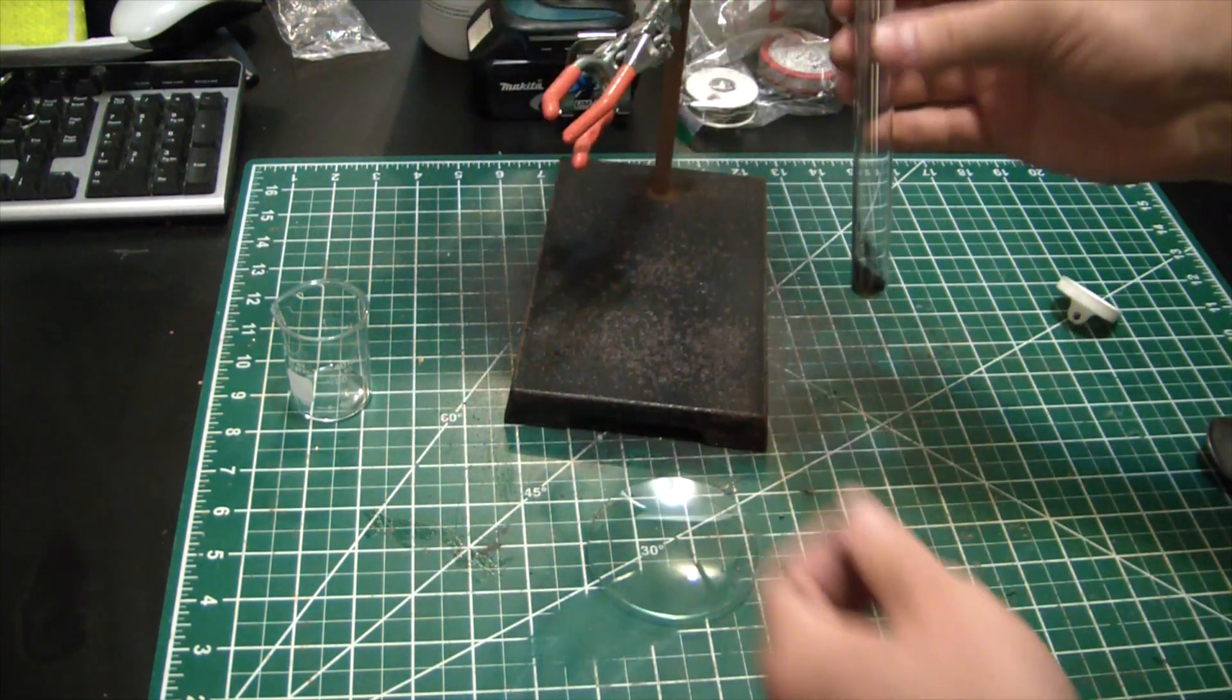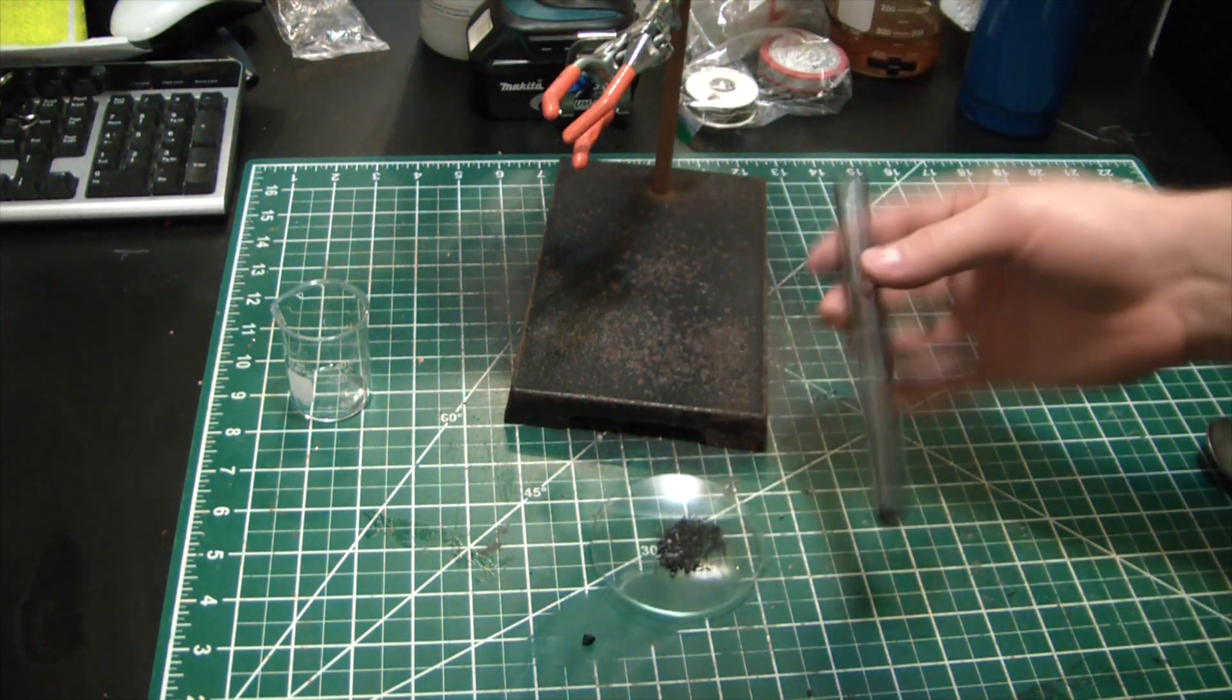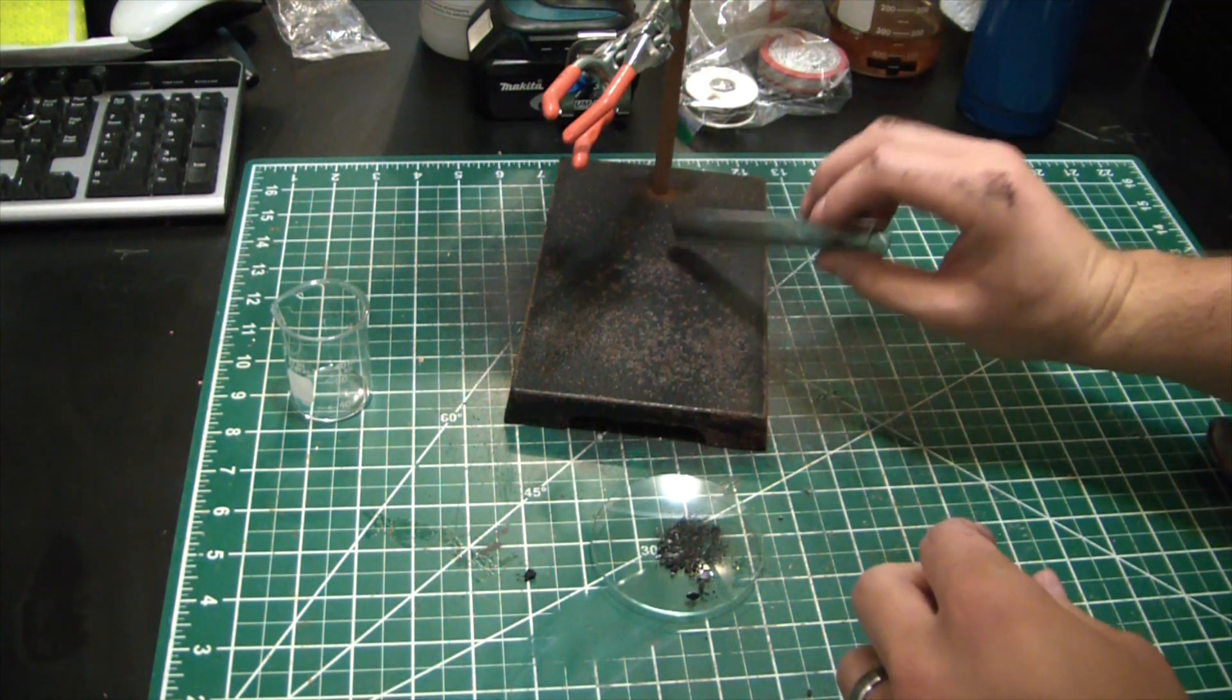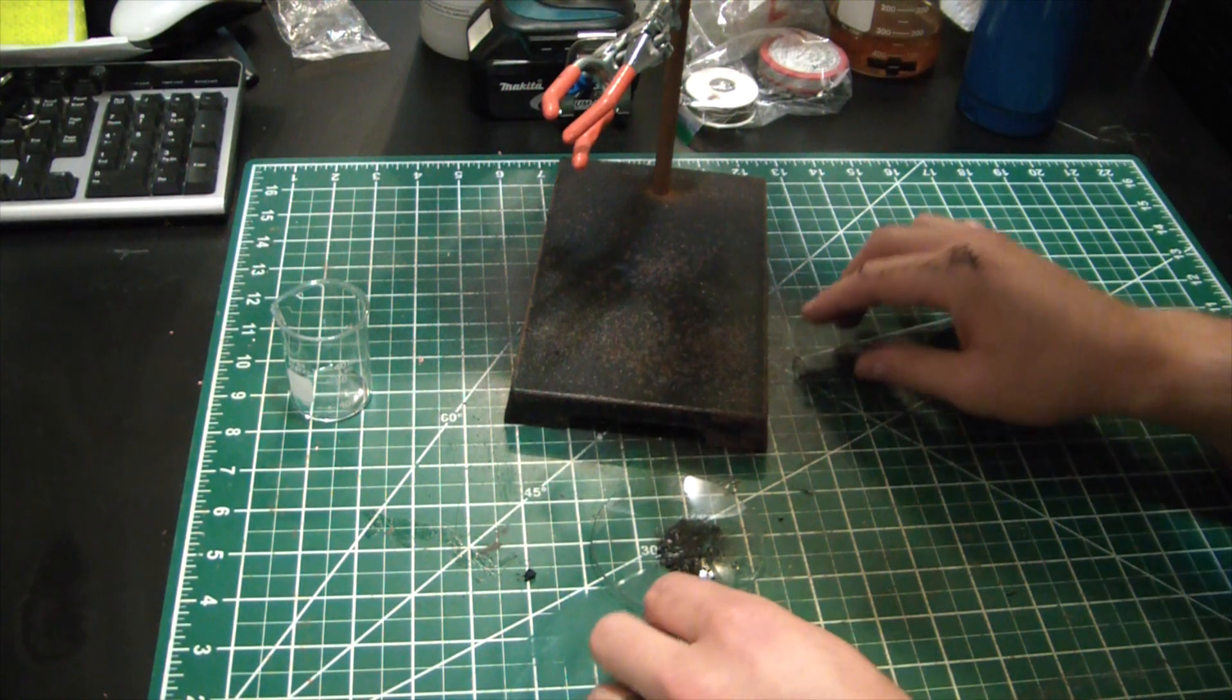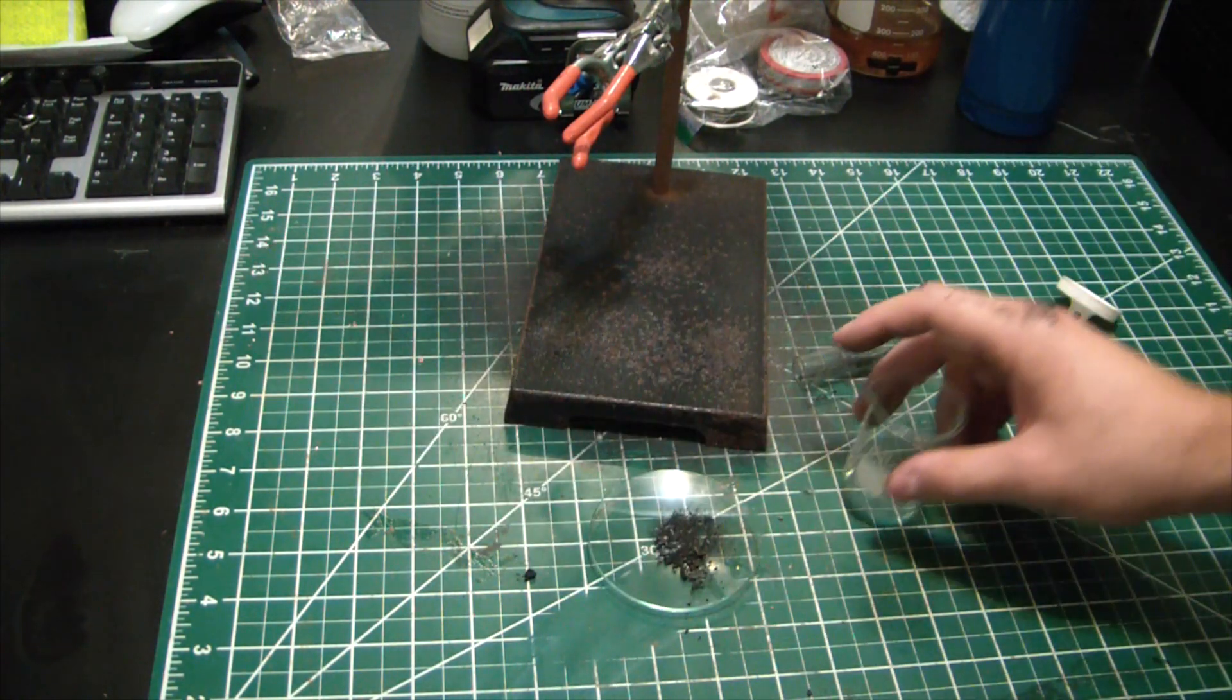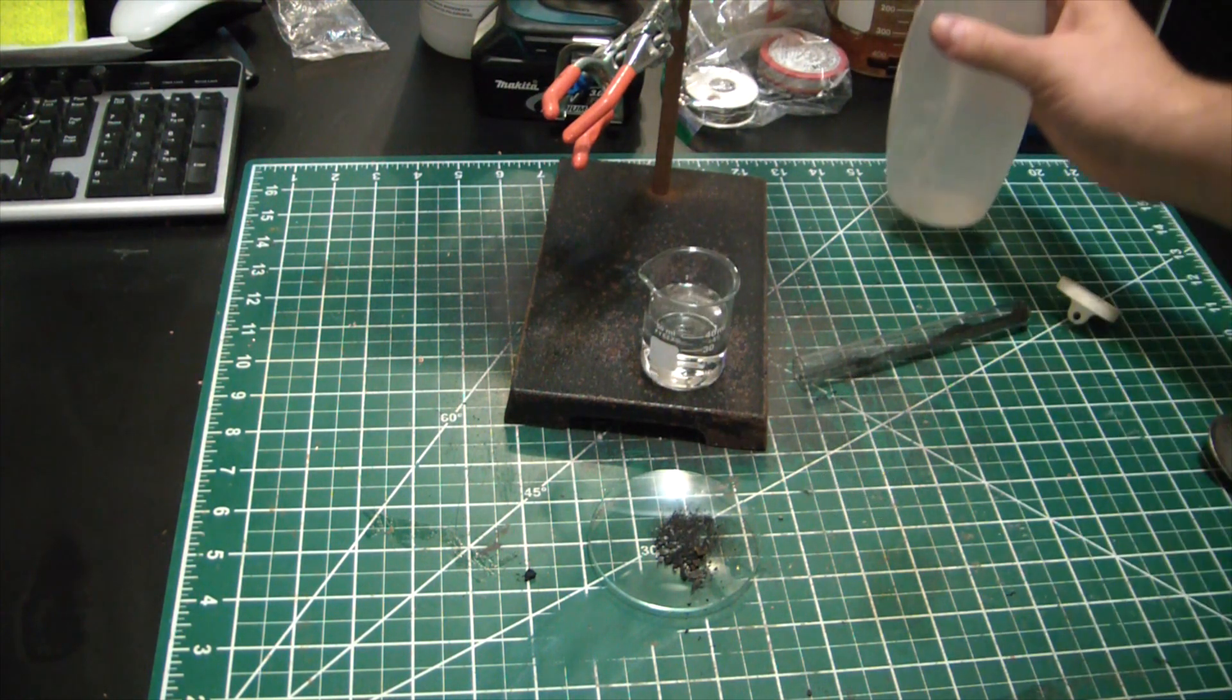All right, let's see what we got here. Looks like the carbide's kind of stuck down there. There we go. I think that's it. I think we got some calcium carbide.